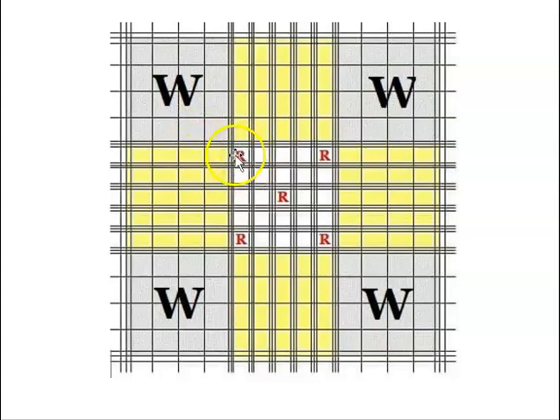The volume for this little tiny square, and there's 25 in each large square, so if you count all these, there should be 25 small squares within the large square, is 0.004 millimeters cubed or microliters. So that's what we were just talking about: the volume for each of the large squares and the volume for each of the small squares.